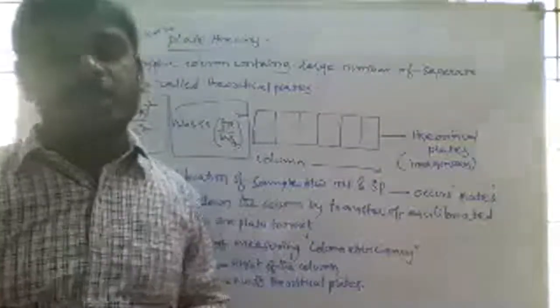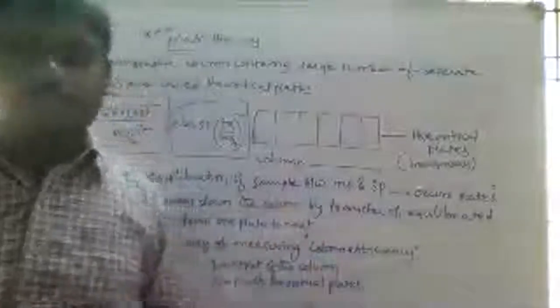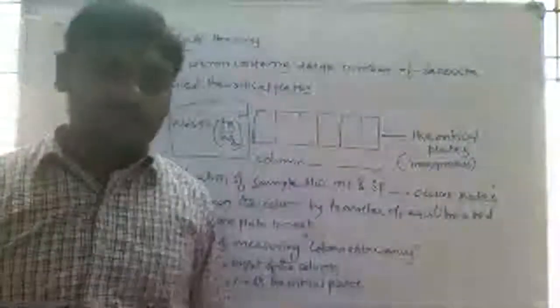As we can see from the equation, the column behaves as if it has a different number of plates for different solutes in a mixture.